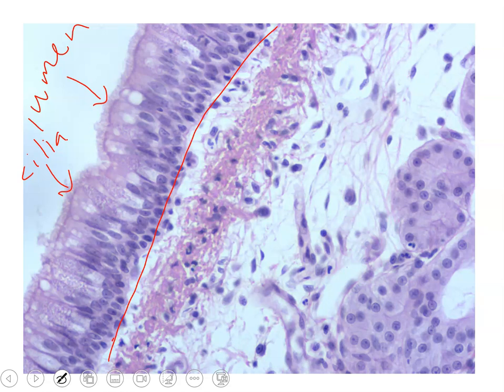We have our goblet cells, which you can kind of see between our epithelial cells that also secrete mucus, so that the mucus will line the surface of the ciliated pseudostratified columnar epithelium, and any particulates such as dust, pollen, allergens, bacteria, anything that enters our nasal passages or respiratory passageways can then be caught in that mucus, and the cilia can then move this material and help us to expectorate out any of the particulate that might be caught in the mucus to also help protect the body.